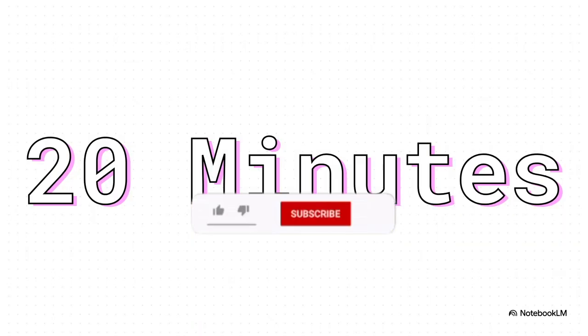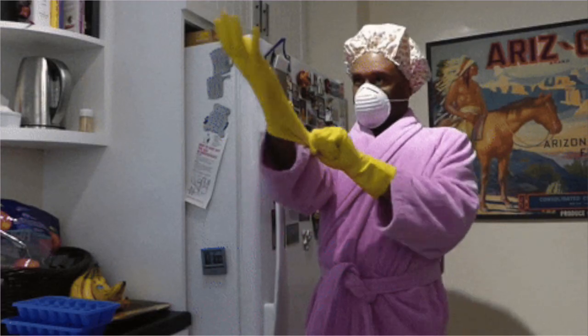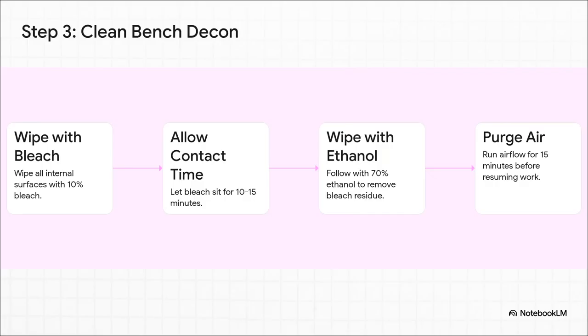The 20-minute rule. This is the most crucial. The bleach must sit on every surface for a full 20 minutes. This non-negotiable contact time is scientifically proven to be the minimum required to kill the hardest fungal and bacterial contaminants. Then you can rinse and reassemble. Wipe surfaces with sterile distilled water to remove corrosive bleach residue before putting the parts back and turning the incubator back on. Step 3, we want to secure the sterile workspace, the hood.